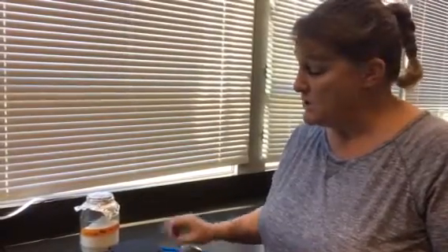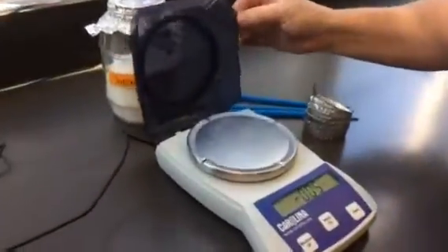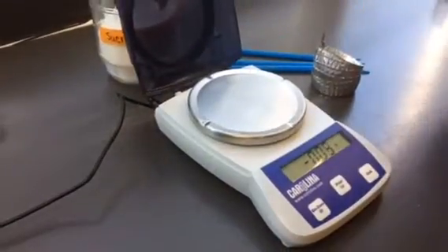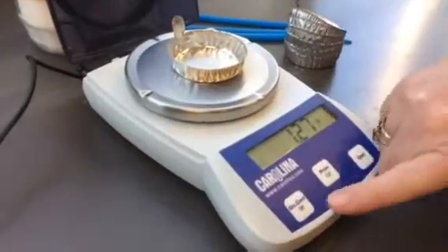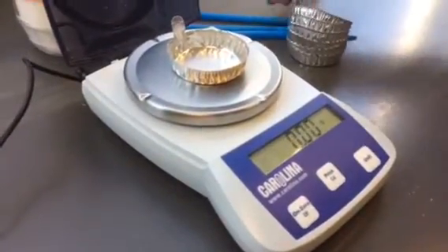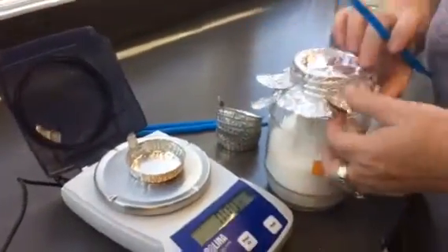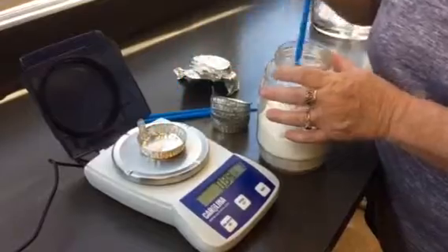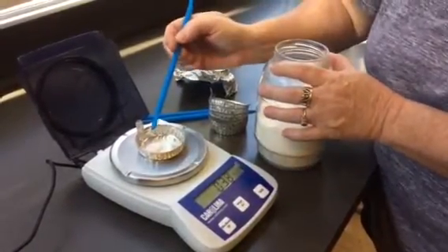It's called stoichiometry. When we weigh something, first of all, with these scales, you have to open the lid. It kind of looks like you could put something here, but you can't. You've got to open the lid. Make sure that you put your weigh boat onto the scale and then zero the scale so it says 0. And now you can take your solid and weigh it out to however much you calculate that you need.